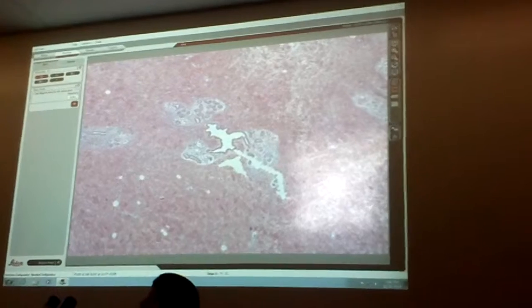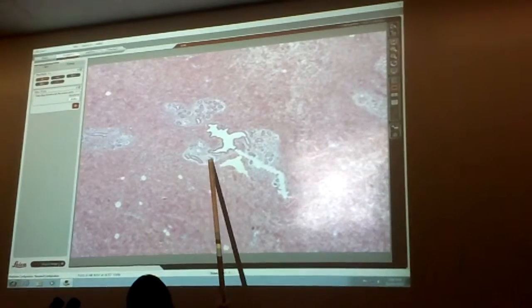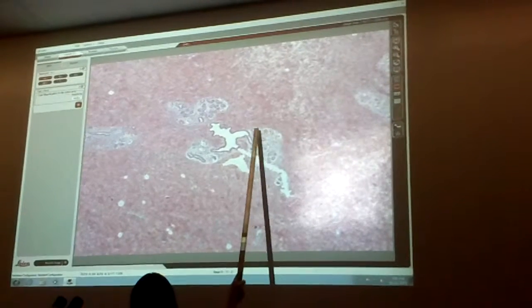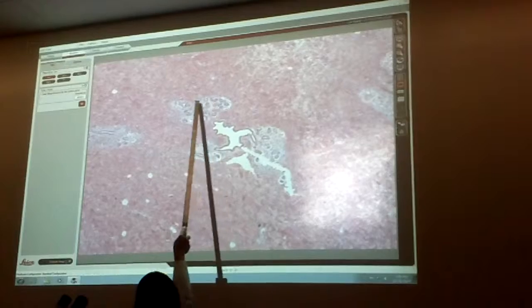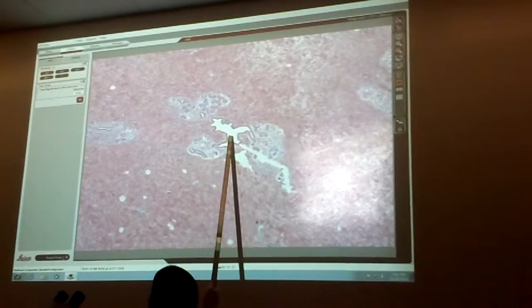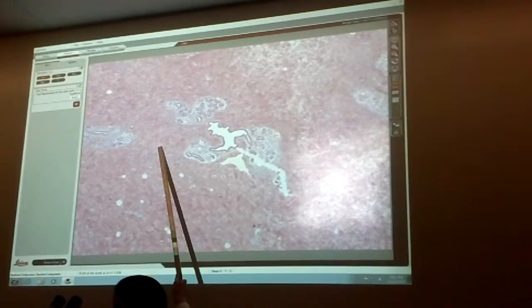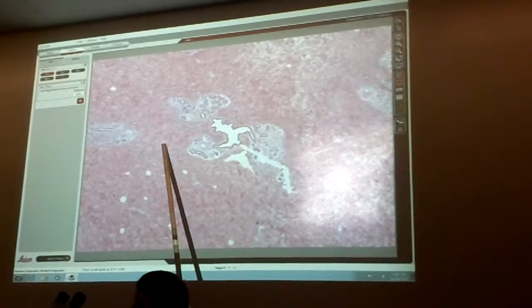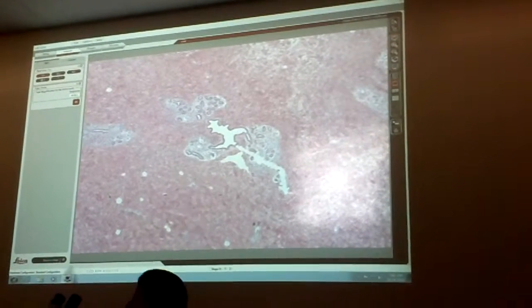Inside each lobule are smaller glandular alveoli. All these little structures inside, glandular alveoli. What's the big area? Lobule. What's that thing? Lactiferous duct. All this? Interlobular connective tissue. And then our adipose, kind of here and here and here.